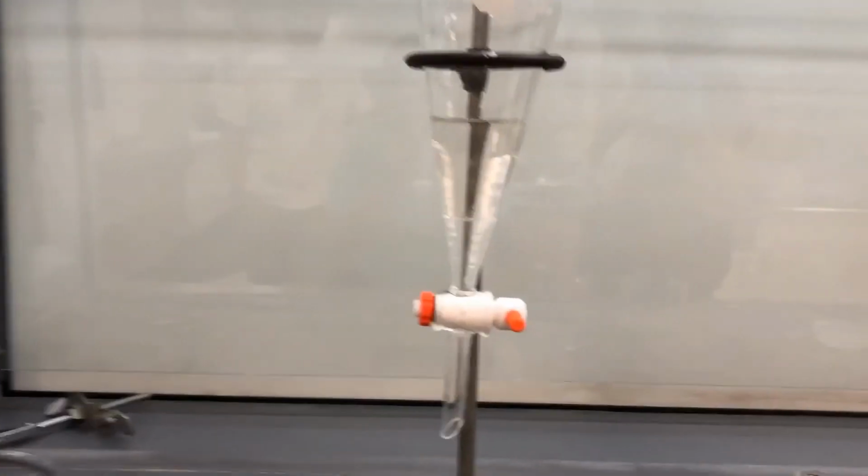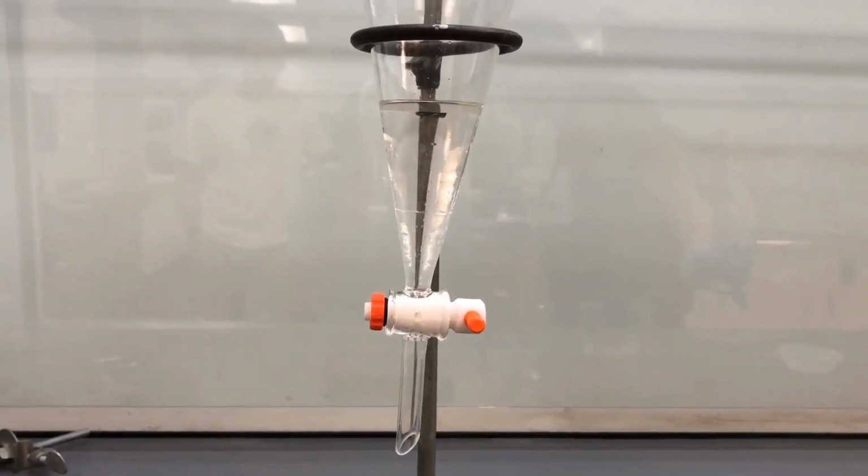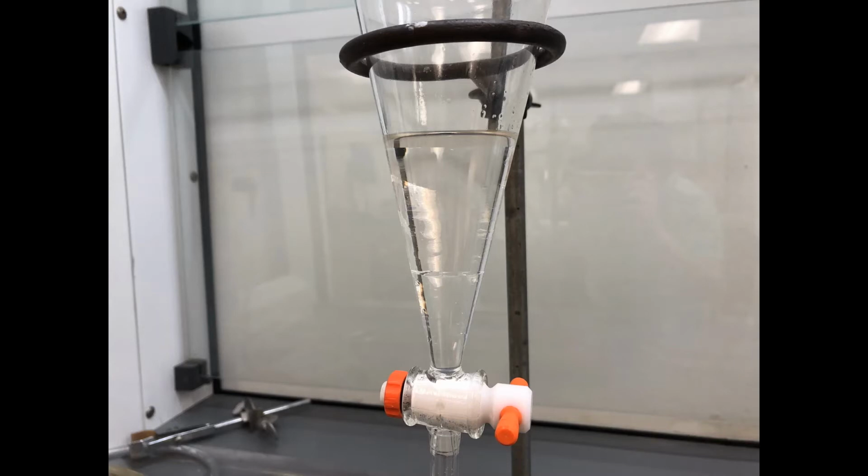You'll see 2 distinct layers form. It is your job to distinguish between your aqueous and your organic layer. As mentioned previously, your aqueous layer will be the layer that contains water, and the organic layer will be the layer that includes your organic material. You are also able to determine which layer is which by calculating the density of your compounds in your mixture. The layer that is more dense will always be at the bottom.